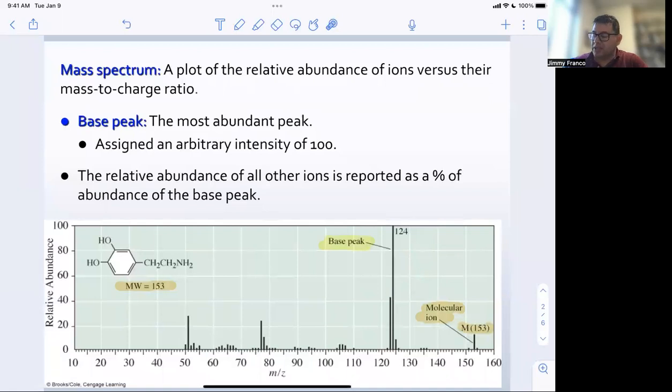Right? And so a lot of times what we're going to see is alcohol groups tend to leave in the form of water. Things next to benzene rings tend to break off because benzenes are so stable by themselves. And so we're going to have different places we can actually cleave the molecules. So we'll talk a little bit about that.